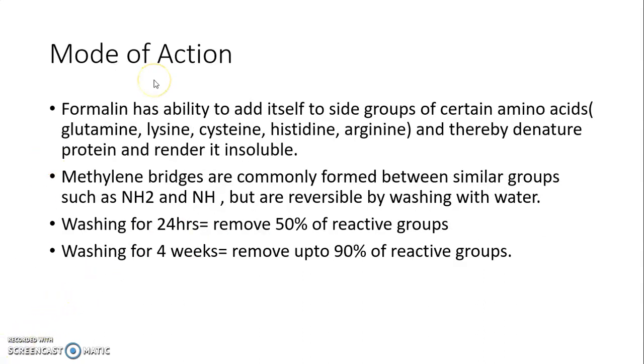So mode of action. Formalin has ability to add itself to side groups of certain amino acids. Glutamine, lysine, these are important. Others are cysteine, histidine, arginine, and thereby denature the protein and render it insoluble.